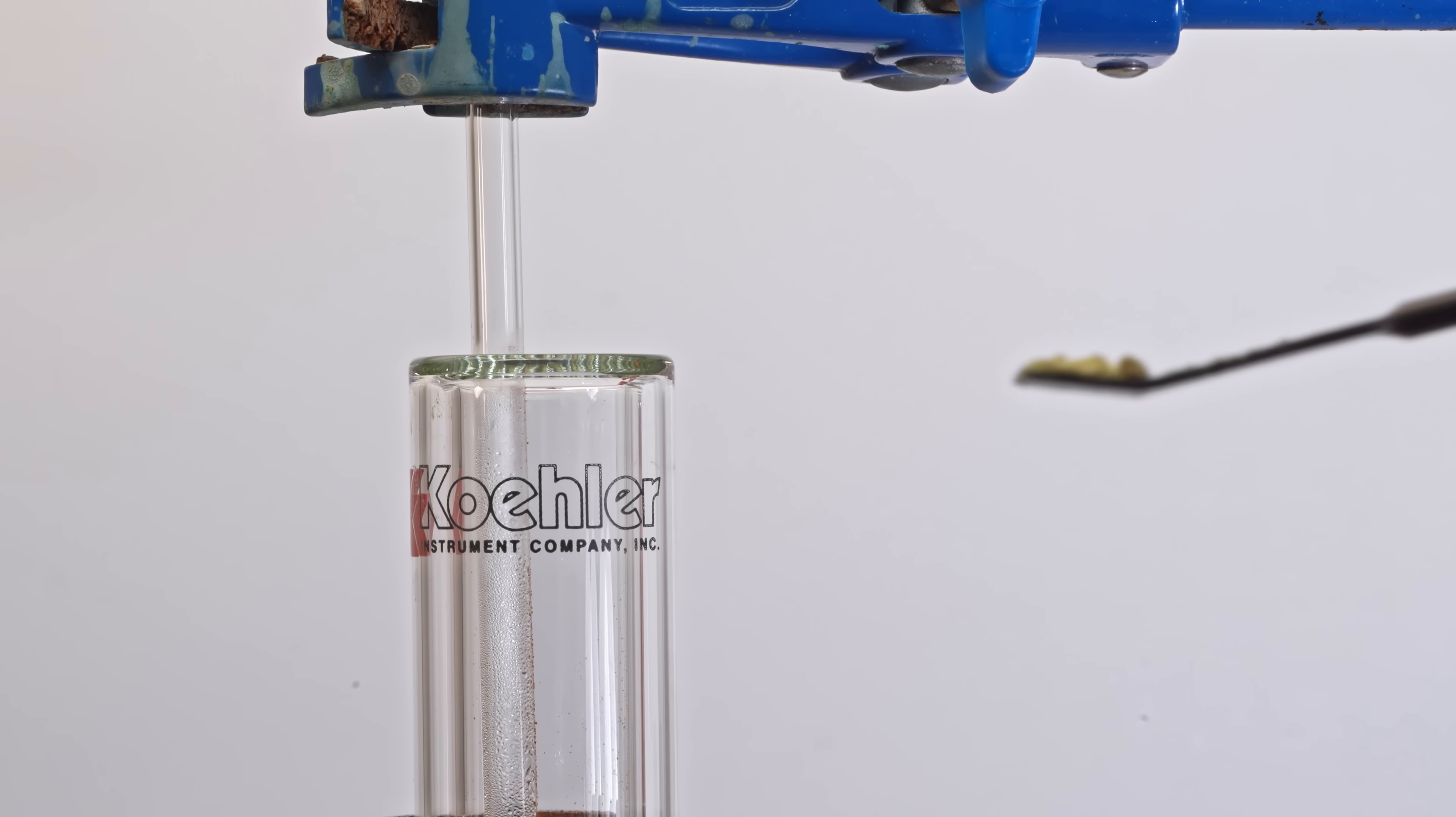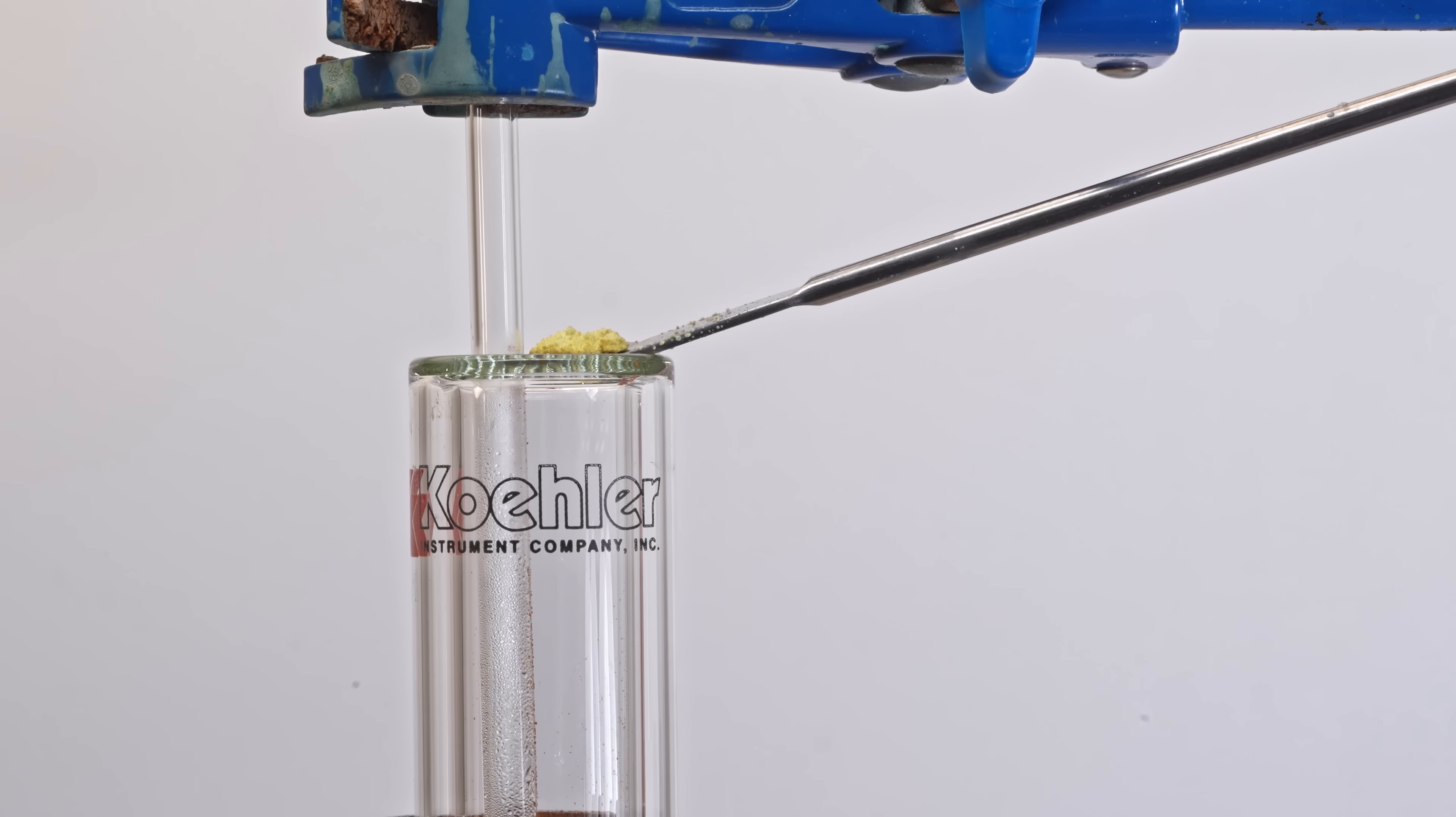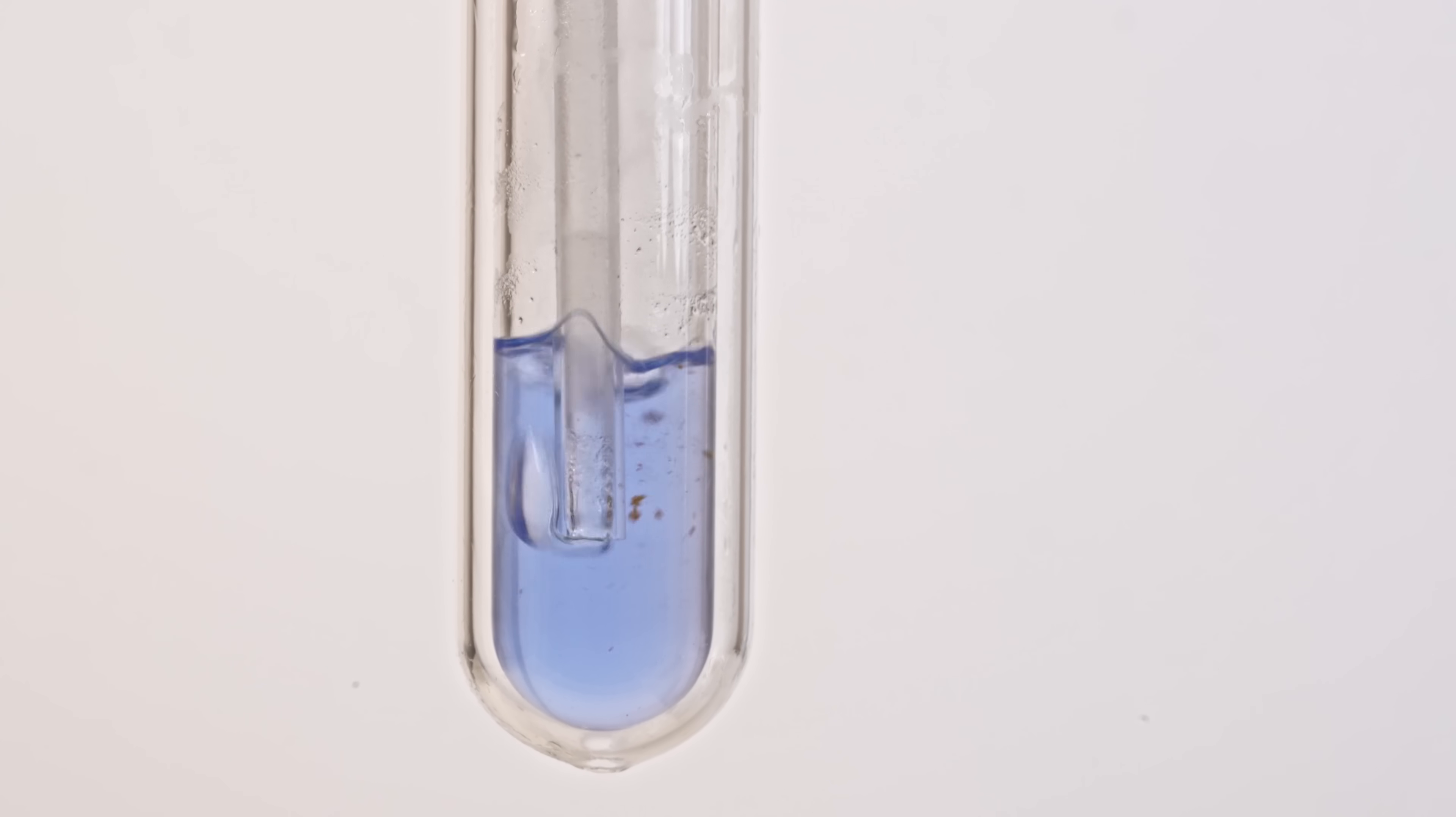Now I add potassium superoxide to the solution, it immediately changes from yellow to red, and over time the red becomes more saturated, indicating the formation of potassium ozonide.